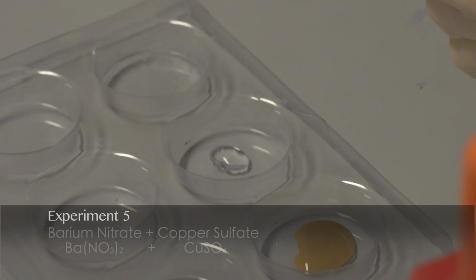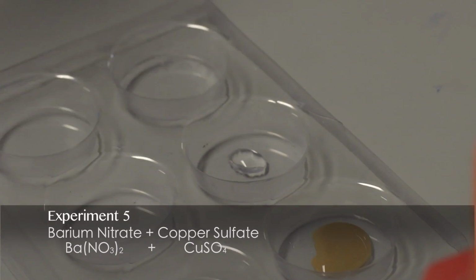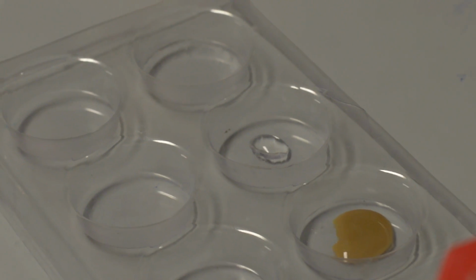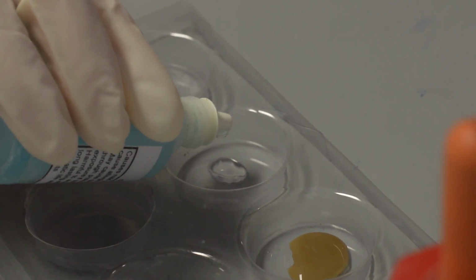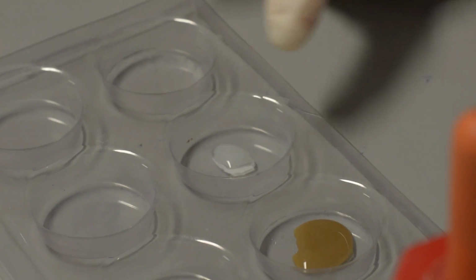Barium nitrate's been added, and we're mixing that with copper sulfate. The blue one. How many do I do? Just add a couple of drops. Colour change.